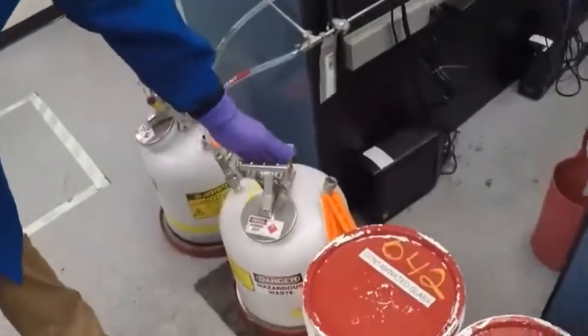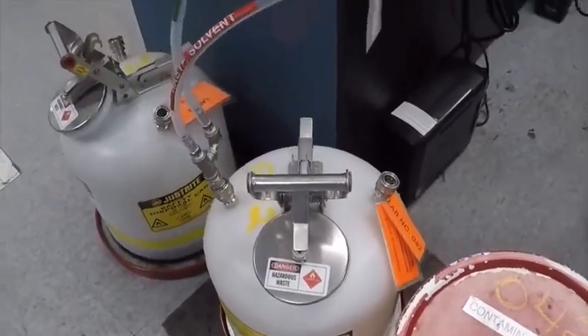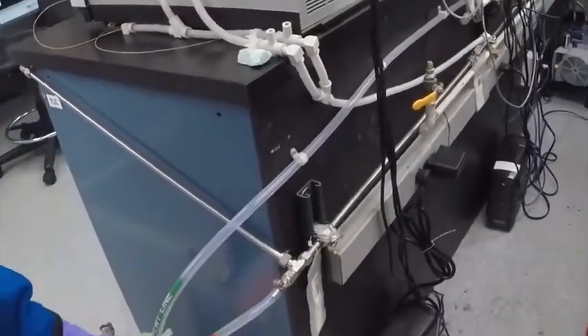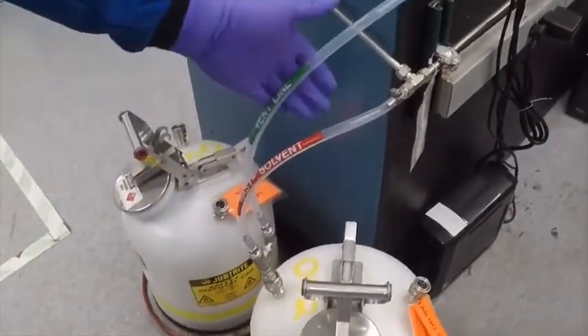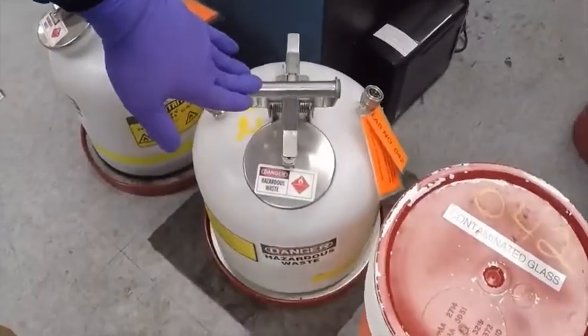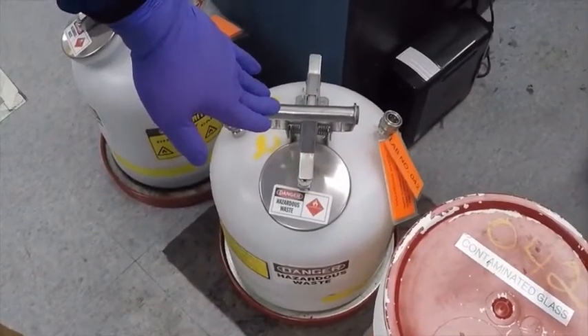Next, I'd like to talk about hazardous waste in your chemical laboratory. All hazardous waste needs to be controlled and disposed of properly. Our waste solvents are collected in a satellite accumulation container that is properly labeled. For our LCs, all waste from the instruments is manifolded and flows into the container, and a vent line keeps it from overpressurizing. These containers are allowed to be left on site until they're full, then they must go to your waste accumulation area. How long they're permitted to remain there depends on the size of your site.